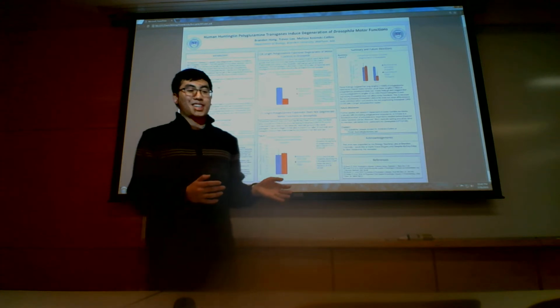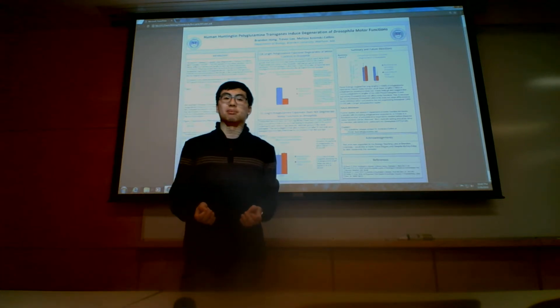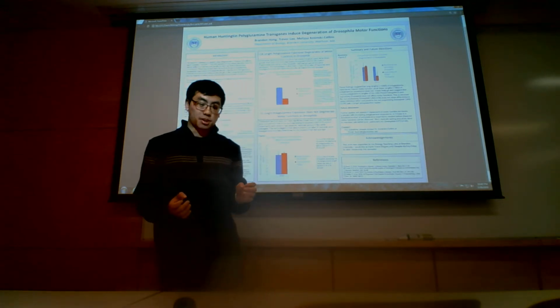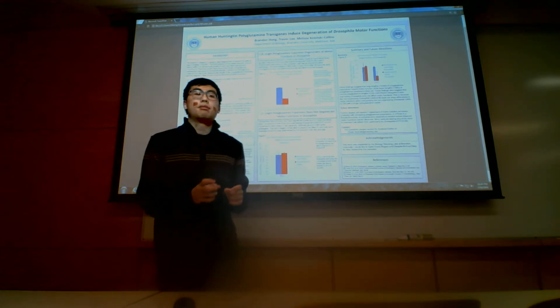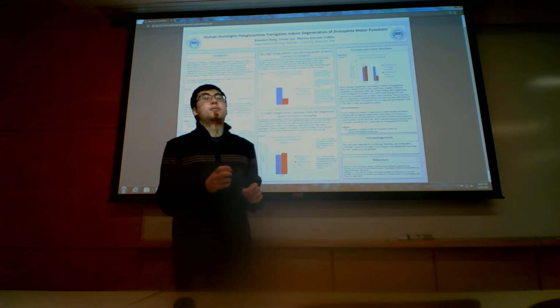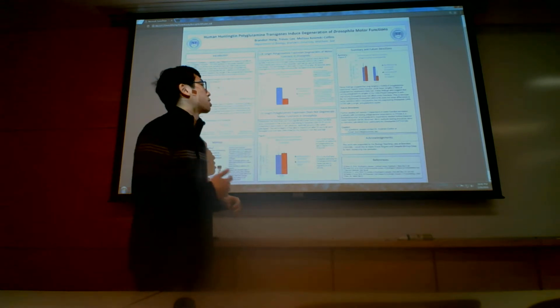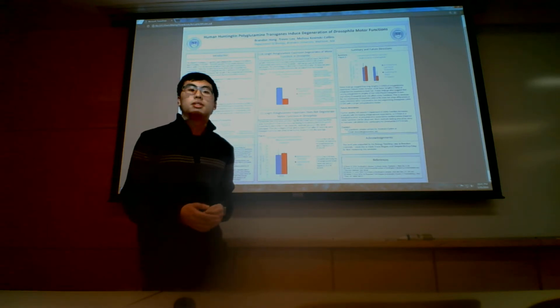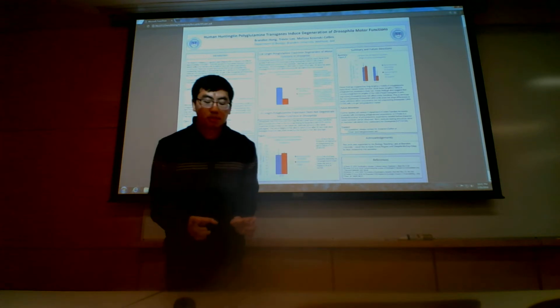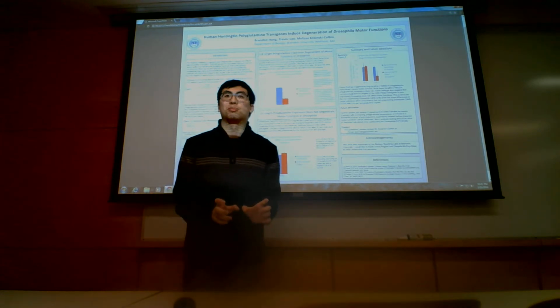Whereas in another replicate, 0 were able to migrate 8 centimeters in 30 seconds. So that means that the average percentage of flies able to migrate 8 centimeters in 30 seconds that were expressing the HTT 128 glutamine repeat was 24%. But that also means that the error was 24%.